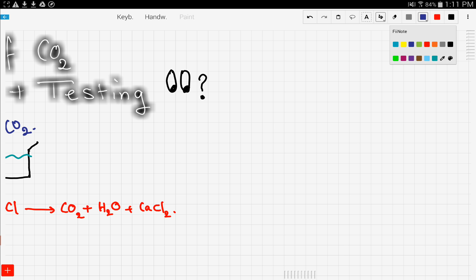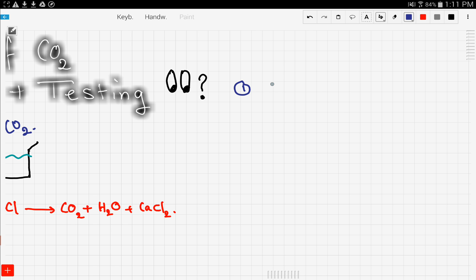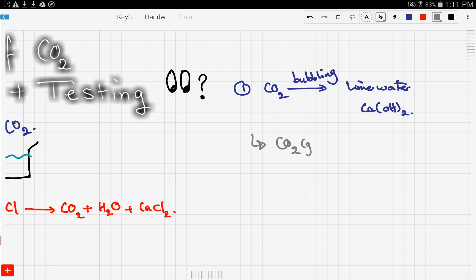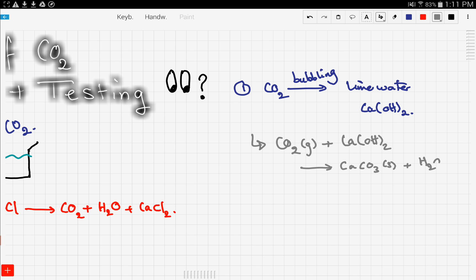The first step is to bubble the CO₂ gas through some limewater. Limewater is basically calcium hydroxide. The reaction that occurs is: CO₂ gas reacting with calcium hydroxide gives calcium carbonate plus water. Since calcium carbonate is in solid form, the solution will become cloudy.